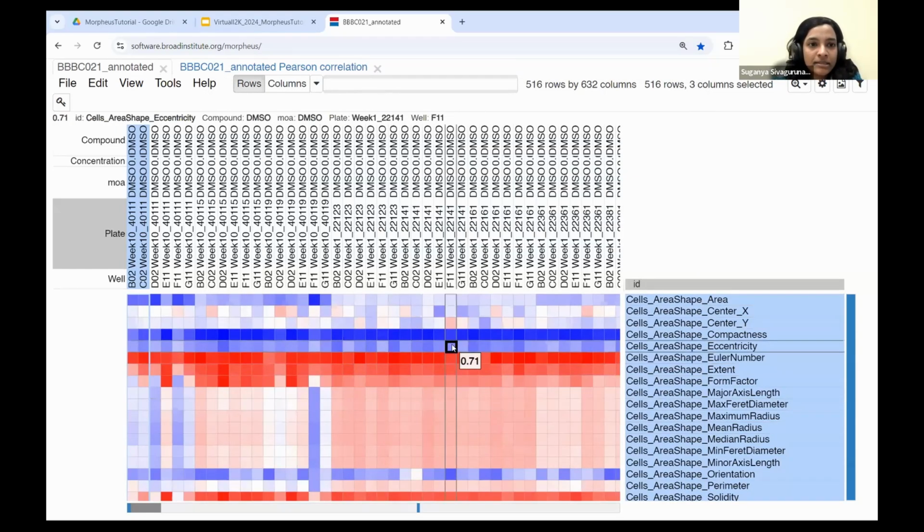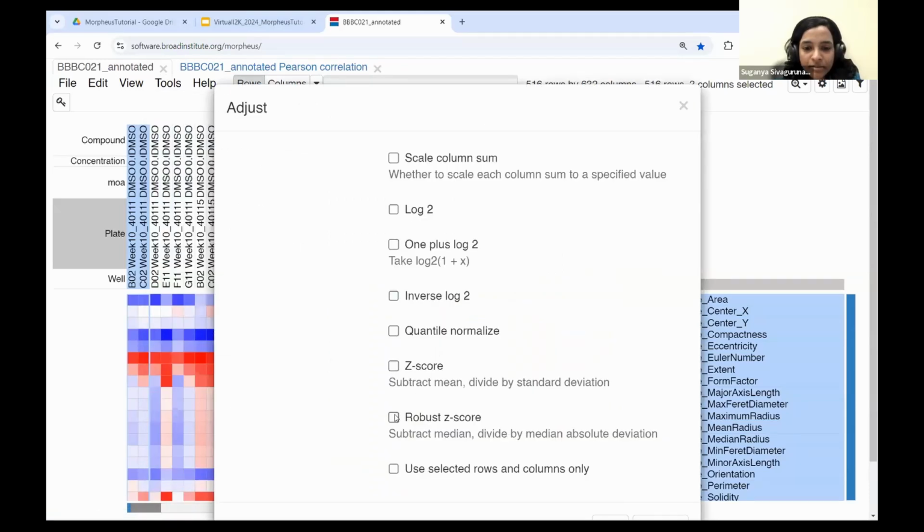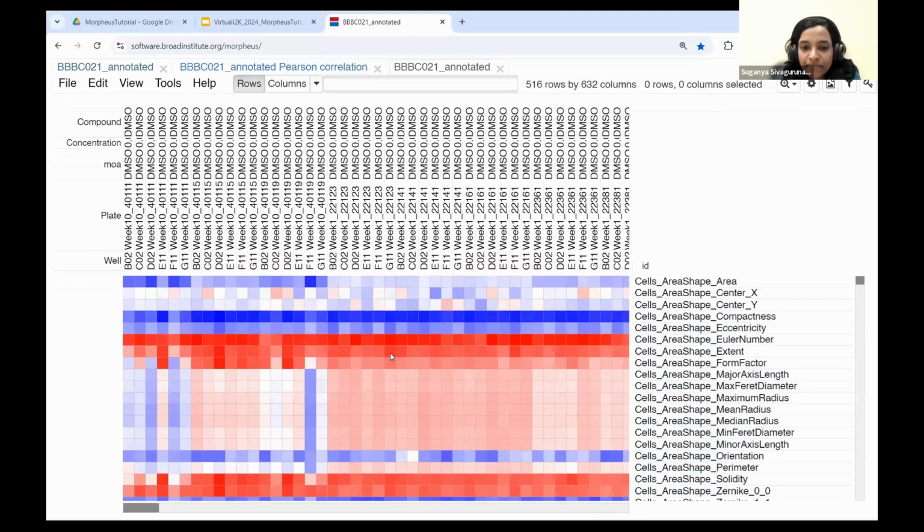And once this is done, you could now see, okay, why isn't it happening once again? Okay, robust z-score. And oh yeah, I didn't click OK the previous time. Now you could see, unlike the previous time where we were seeing the area to be in thousands, now we see somewhere in the range of 3.